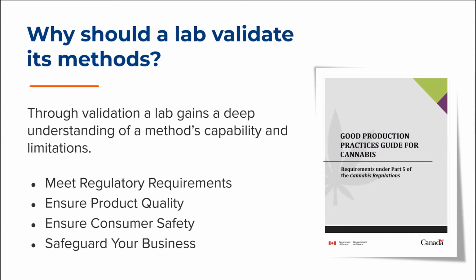Based on the data collected during validation, the laboratory will have a detailed understanding of how the method's parameters, such as mobile phase compositions, gradients, temperatures, flow rates, injection volumes, etc., will impact the separation. This knowledge can then be applied during an investigation to determine if the method or instrument performance is the root cause of the suspect result. This is really the hidden power of a thorough method validation.